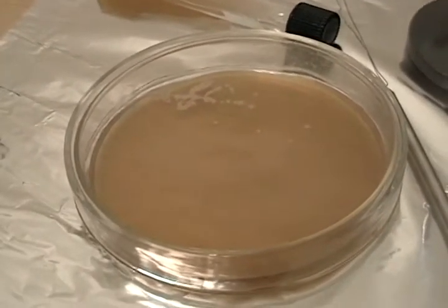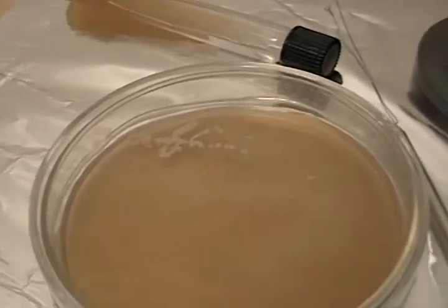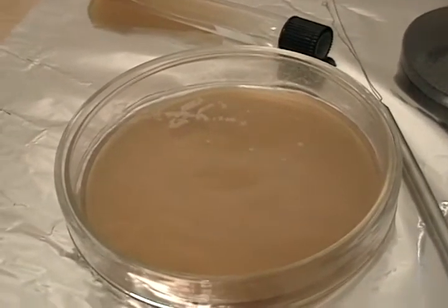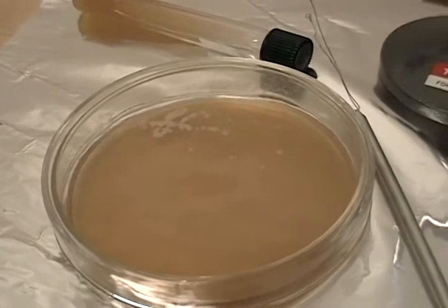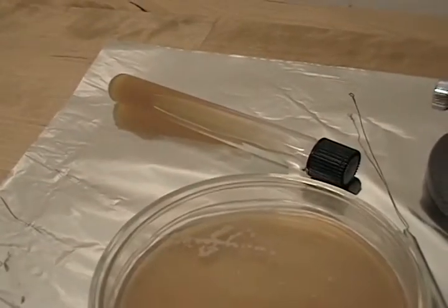So as you can see, after about 3 days of incubation, we have a few single colonies here that I'm going to single out. I'm just going to pick them up with the inoculation loop, drop them into a bit of water so we can mix them really well, and then put it into our prepared slant tube over there.